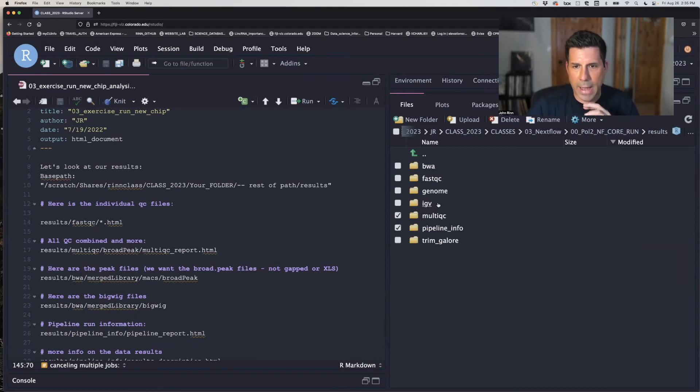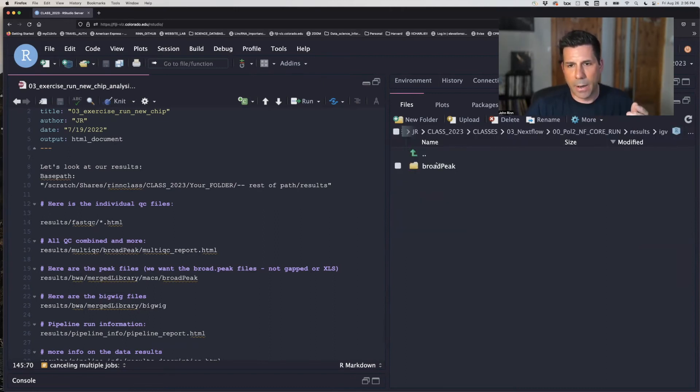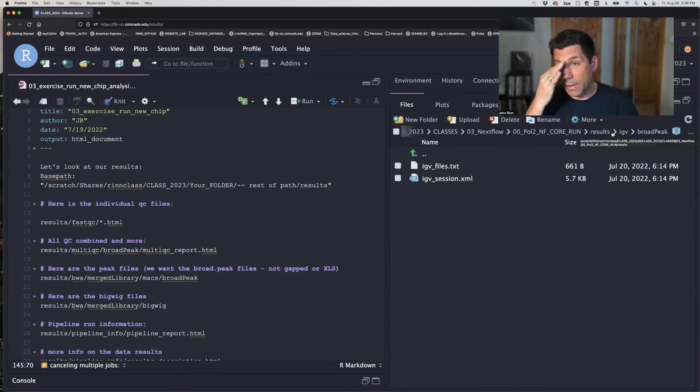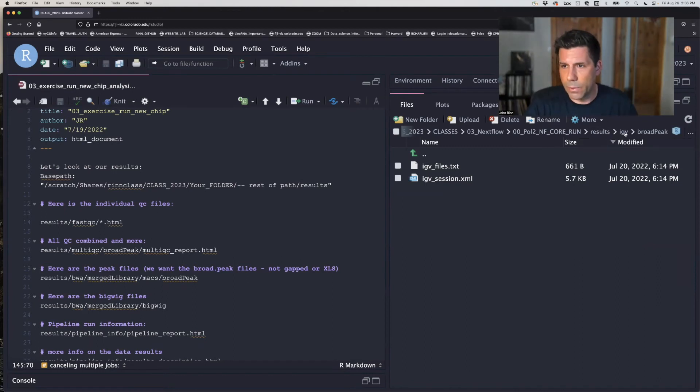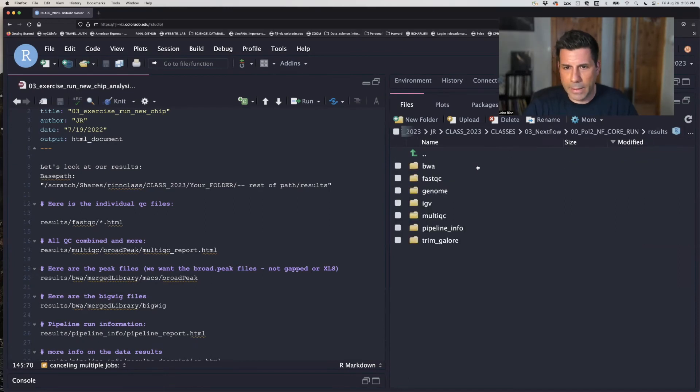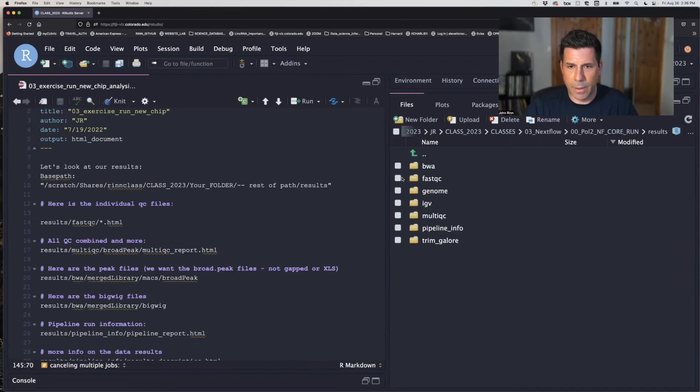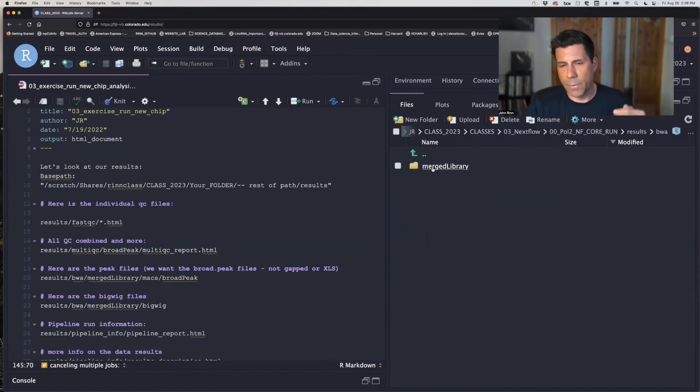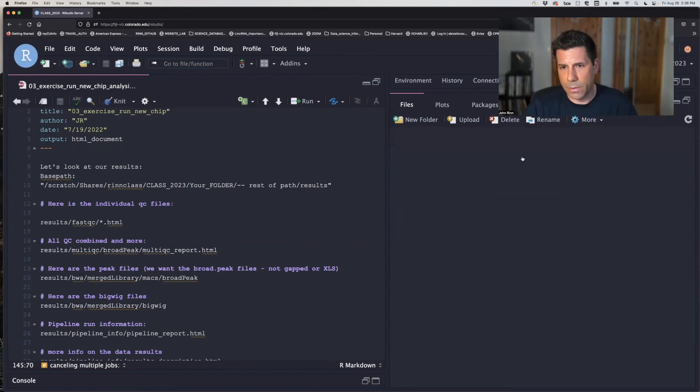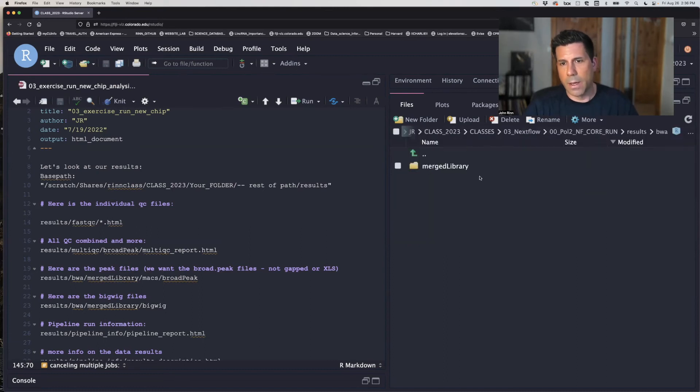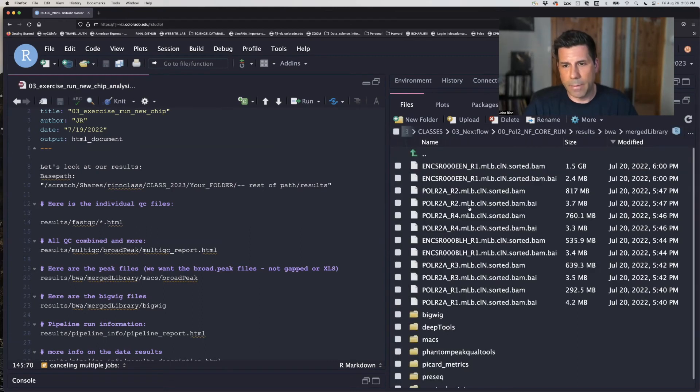Trim galore is just a read trimming program. That's not really worth looking at. We're going to have a whole class on IGB. So in here, we got a bunch of files that can go into IGB that we can visualize the raw data. And we'll do that in the subsequent class soon. BWA is the file folder that has the most stuff you use like routinely. And that's here. This has this merged library. We all have it.